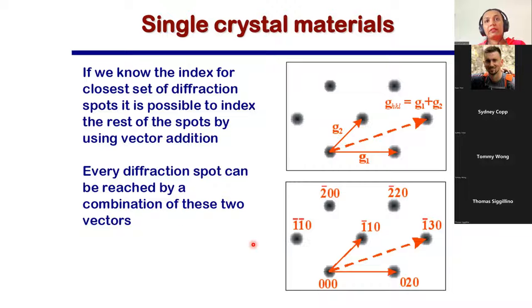Here, we will talk about G.B analysis in the project of Thomas. In reality, you get this diffraction spot, and you will have two brightest spots on your screen. Then you tilt your sample and beam in a way that you get image information from only one G. Then you tilt to another spot, and it's all about tilting.